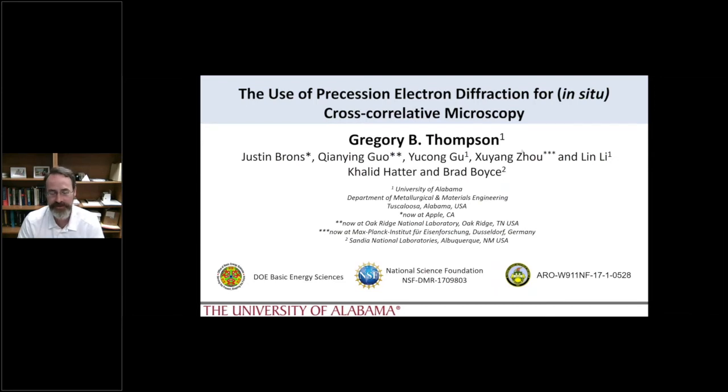My talk, as Robert said, is the third in a series that they've done. What I hope to convey over the next 30 to 40 minutes is how we've used PED, precession electron diffraction, in a variety of different material systems to elucidate and understand the underlying structure that governs properties. So it's really meant to be more of a high-level overview of how the technique has been applied, particularly in the research that I do in my group. And with that, I'm excited to share with you what we've been able to do.